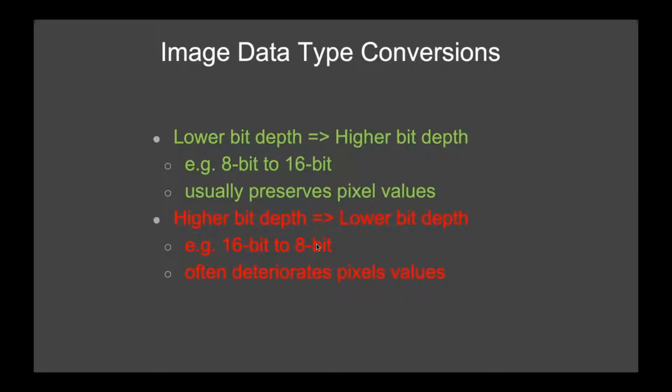Okay. Our next question is, could you please point to some practical examples where KNIME was solving some common image analysis issues? I don't have a specific project, but this week, Monday, Tuesday, Wednesday, I was running a course here at EMBL about basics of bioimage analysis. The first 2 days I was showing things in ImageJ, and then on the third day, we repeated the same concepts in KNIME, and the response was very good. People really liked it. They wanted to have a follow-up course.